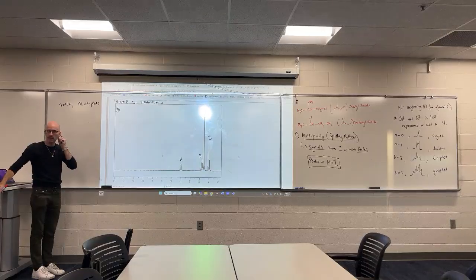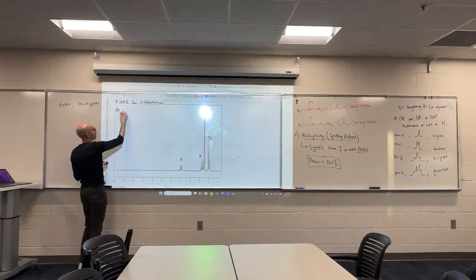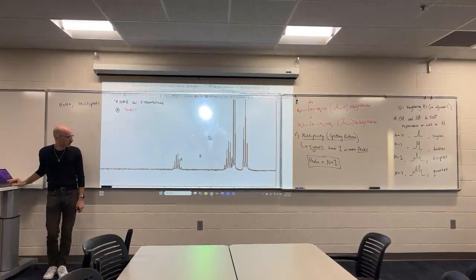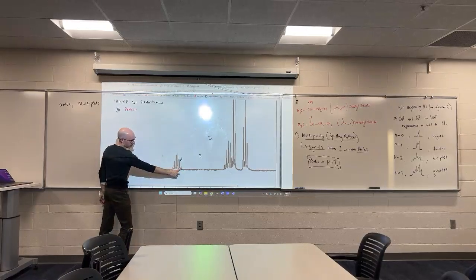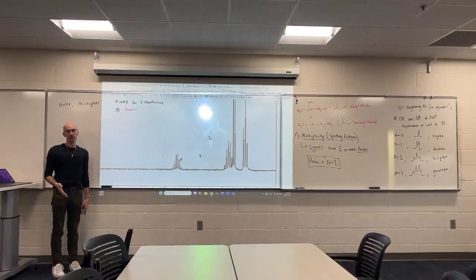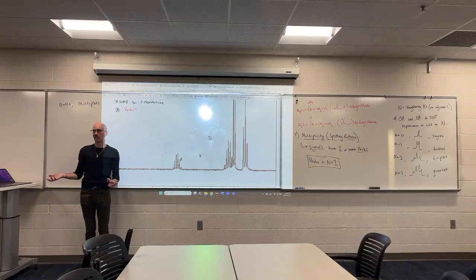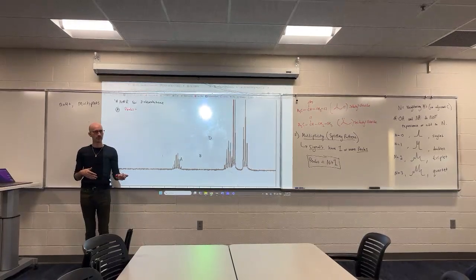How many peaks do you see on A? Six? 1, 2, 3, 4, 5, 6. I wouldn't be mad at you if you said 4. And if you weren't sure what these were, that's fair. So it's either 4 or it's 6. If it's 4, how many neighbors?